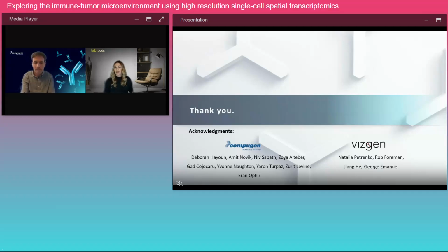Now, Dr. Granite, have you tried alternatives to cell segmentation, like more recent deep learning methods such as ComSeg-based, or has Cellpose 2 provided the most optimal results? I'm dealing with a similar issue in my current project.